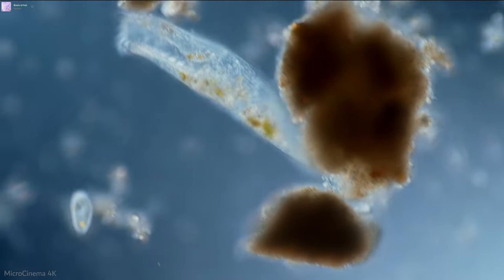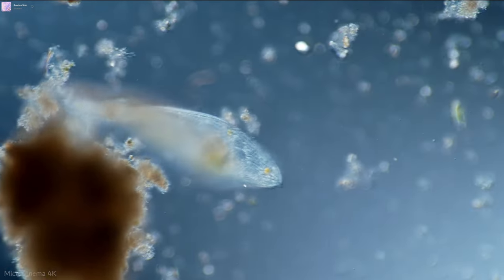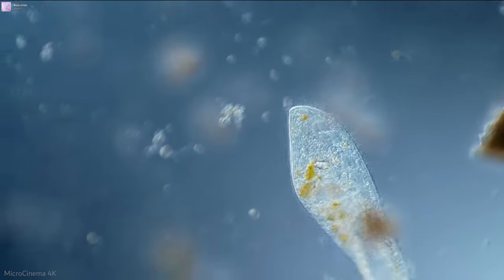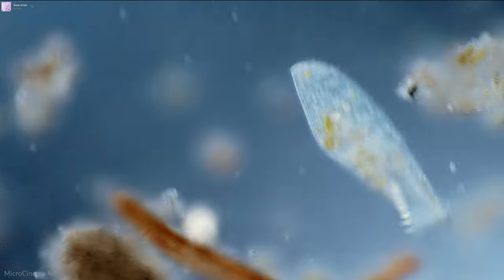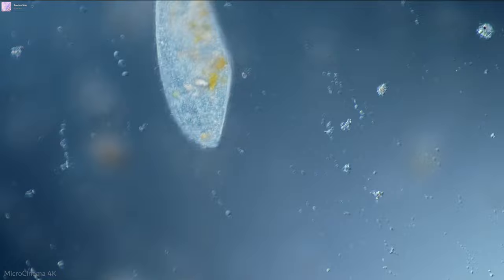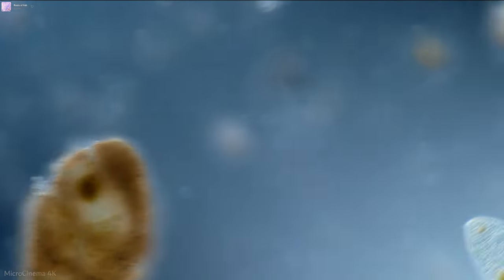They are very squishy. These Condylostoma are in my interstitial marine ciliates book, and that means these are ciliates that exist in between sand grains. And with Condylostoma, that's fast. Condylostoma definitely has this pretty amazing ability to squish itself into cracks and crevices. Seems very deliberate when it does this. Wow, this one's really flying. Oh my goodness.